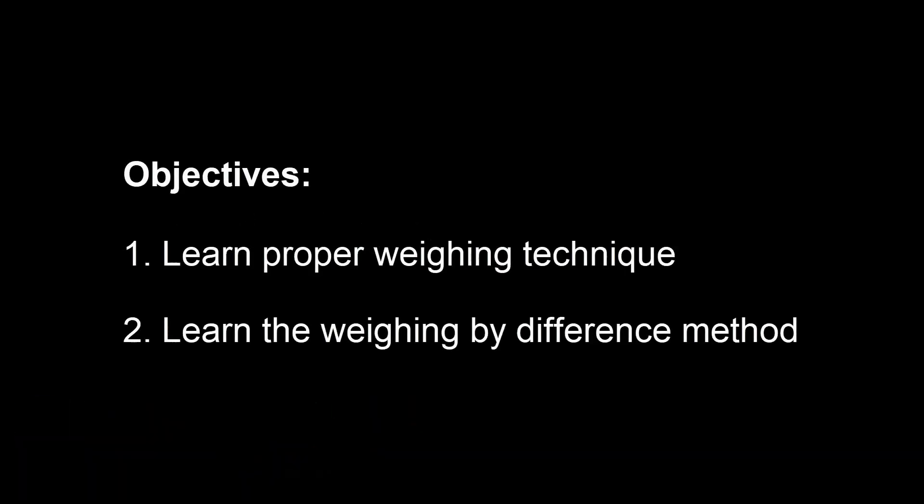Weighing by Difference. The objectives of this video are to learn proper weighing technique and learn the weighing by difference method.